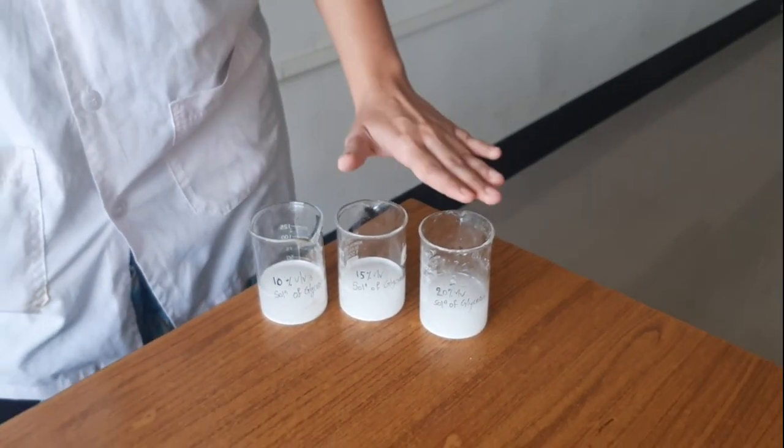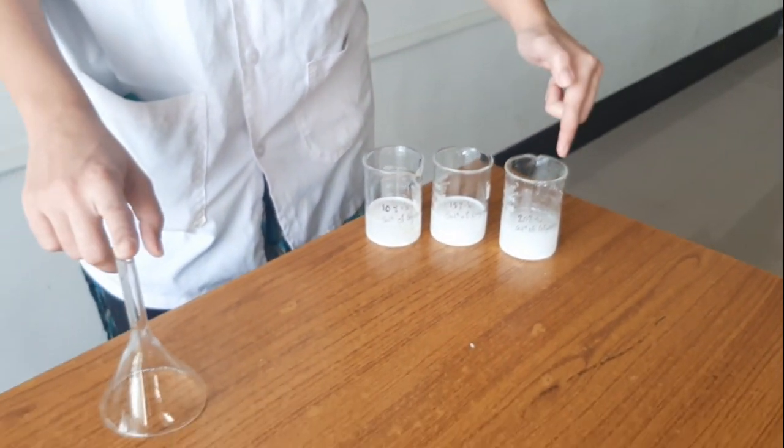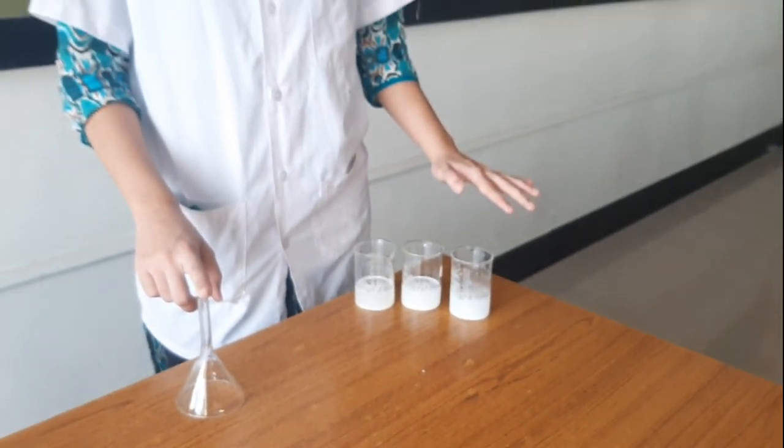Now one by one, using the same funnel, we will filter all these 3 slurries, and we will determine what time is required for each filtration to take place completely. That time we are going to compare. Now we will proceed with our experimental part. Now we will start with our experiment.